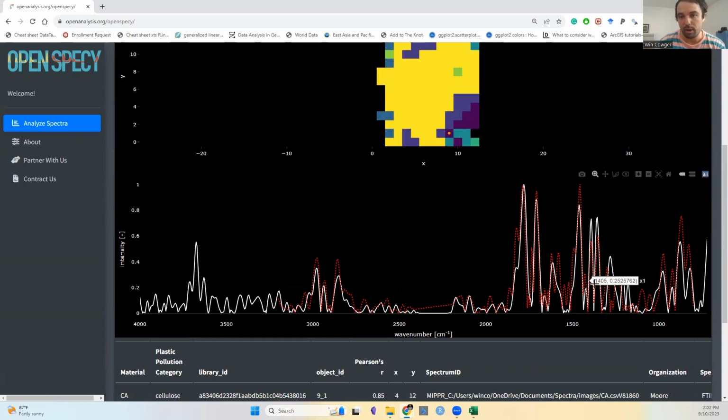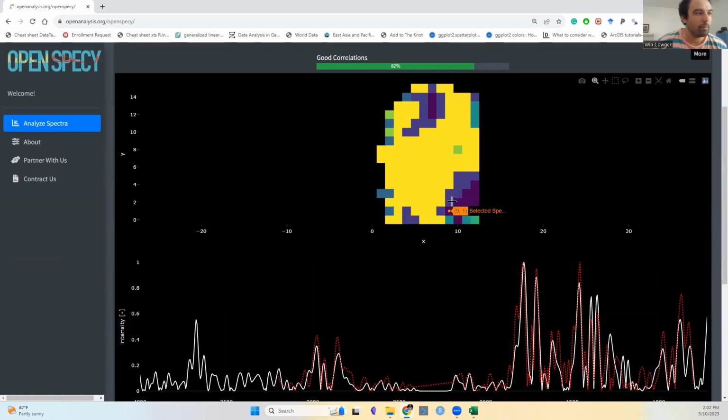Why is this one not making sense? Another thing to note is that the XY coordinates of your pixels are on the pop out when you hover over the spectral map. And the row number is also an important one. That's going to tell you the spectral number in the data set.